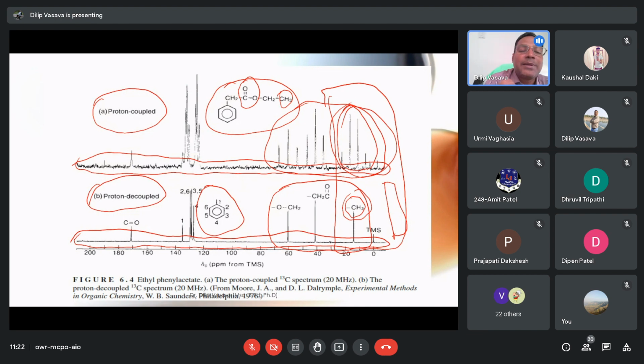So that can be more than 150, the range according to that range. So here it is the carbonyl carbon, so it is somewhere around 170. Okay, now another carbon is left, that is the CH2. So both the environments of the carbons are different.